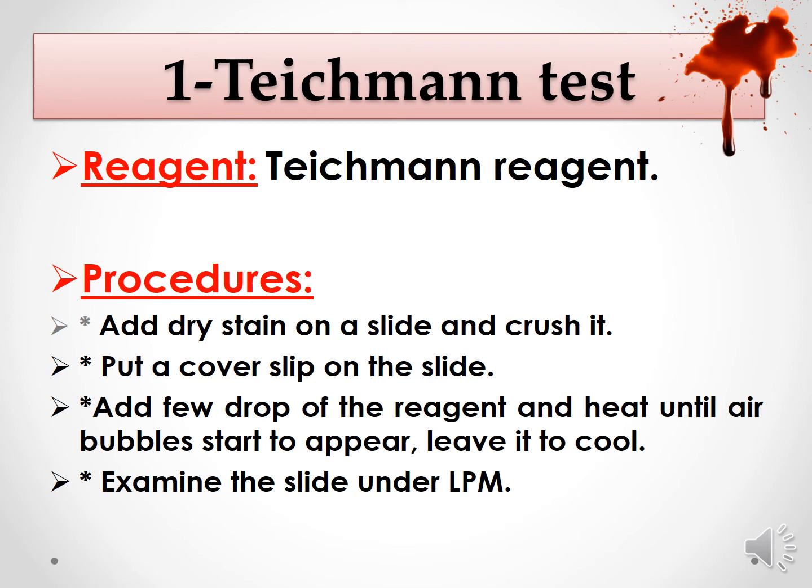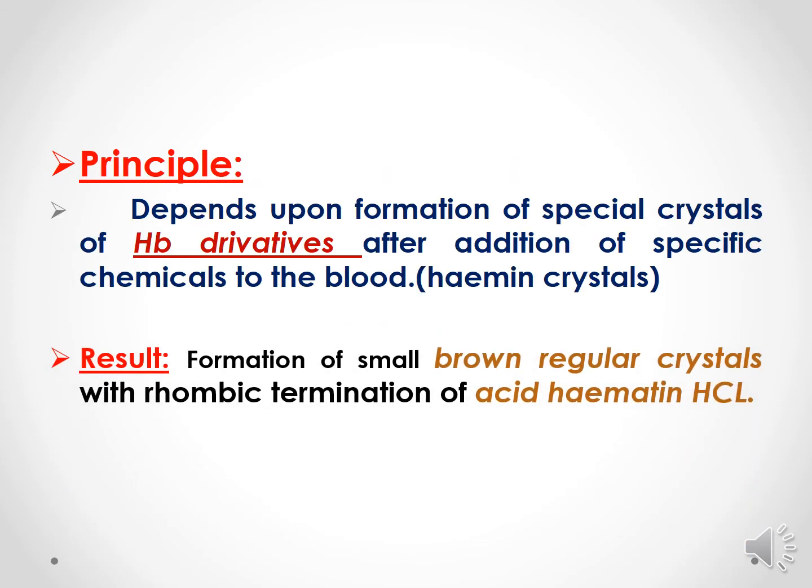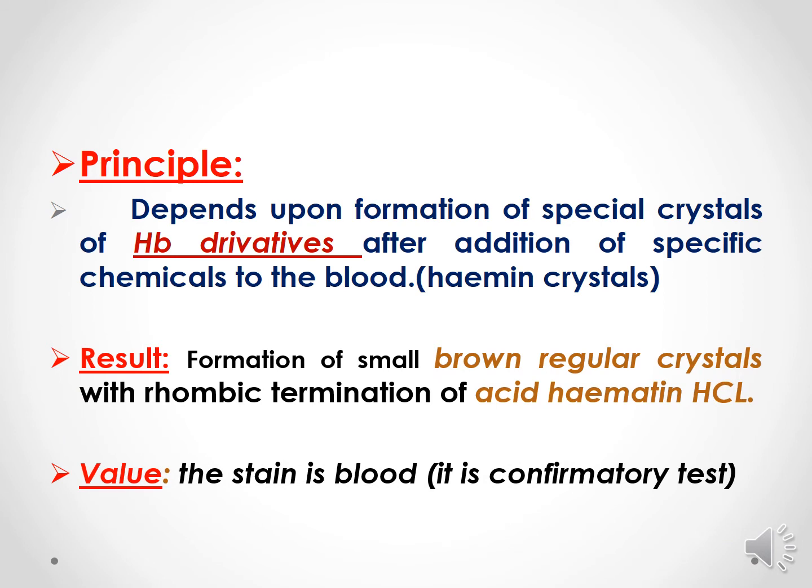Then finally examine this slide under light microscope. Value: it is a confirmatory test, so the stain is blood.